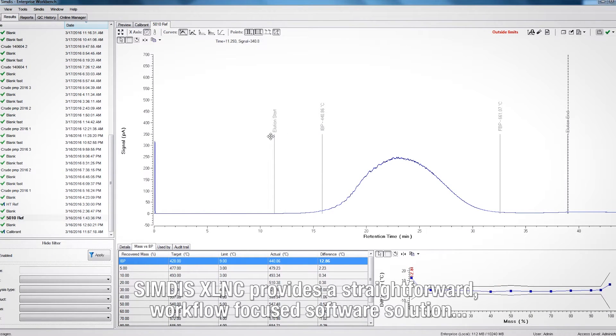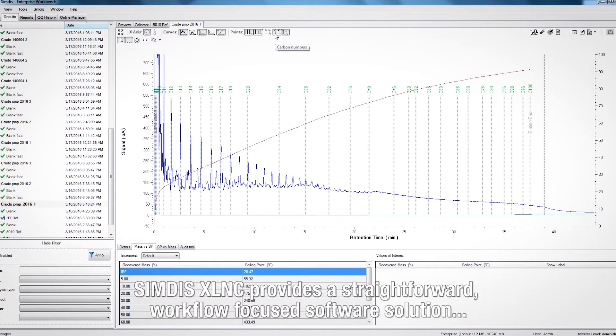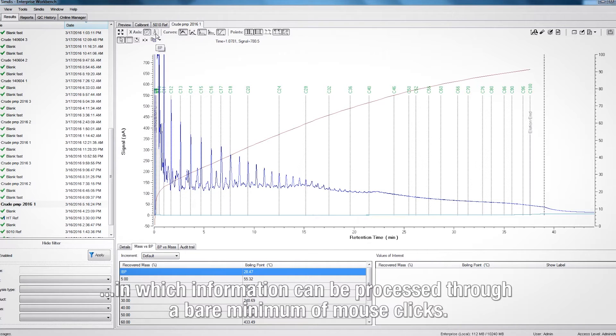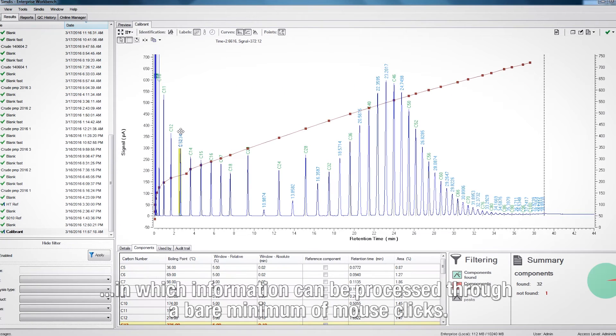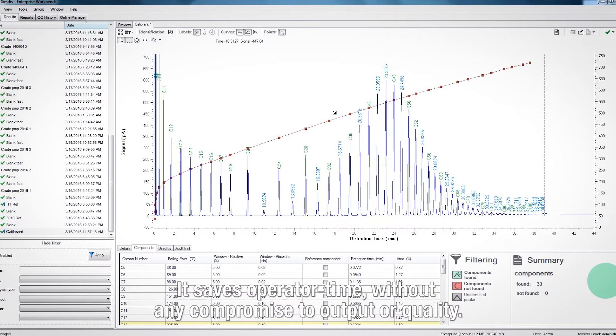SIMDIS Excellence provides a straightforward workflow-focused software solution in which information can be processed through a bare minimum of mouse clicks. It saves operator time without any compromise to output or quality.